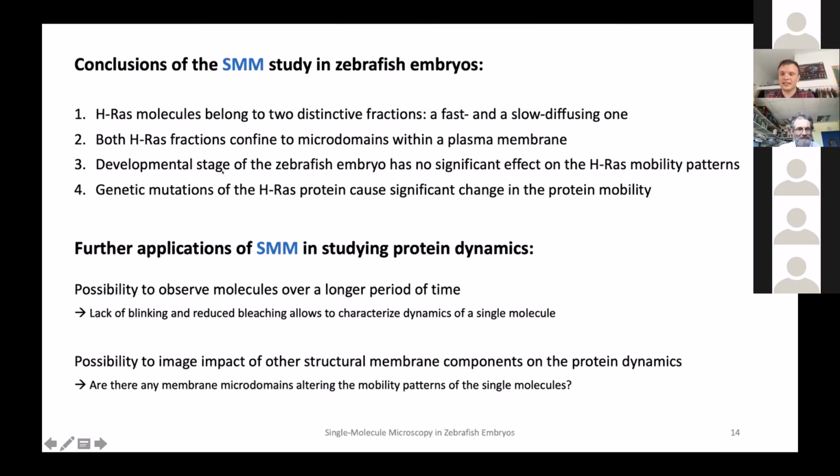And we also did the study characterizing the model, the Zebrafish study. I didn't show the data because there's no time, but we showed that there's no difference when we image the dynamic states at the different developmental stages of the fish, from, let's say, 1 to 2 day old or 3 days post-fertilization stage. So that's very good because the system is reliable.